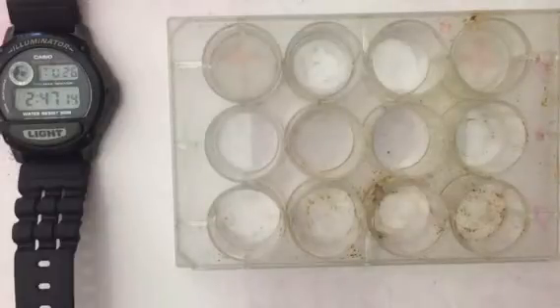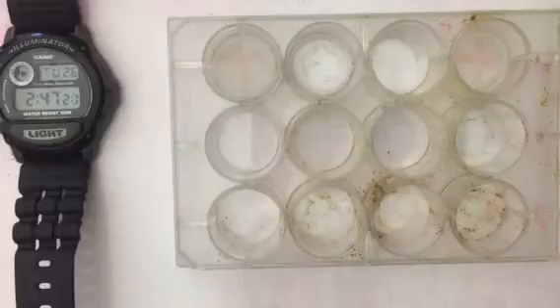And so you can actually use your video as an analysis to say, at what point in this reaction, how long did it take, and can we compare it with other groups as well? And that's the way that hopefully we're going to study these rates.